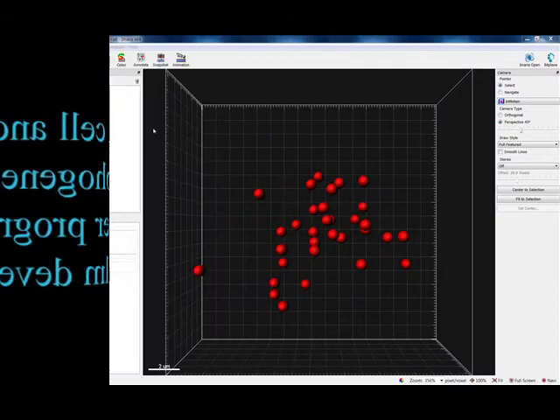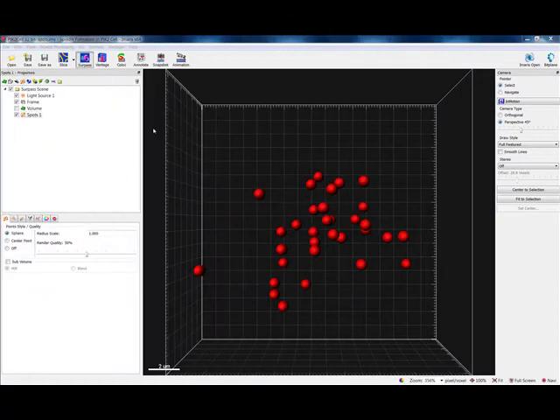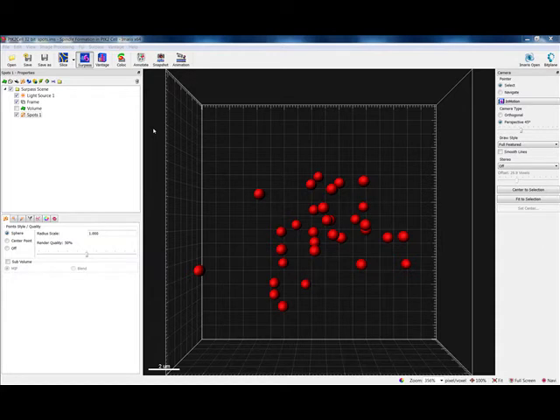We will start at the point where the Spots creation wizard has been completed and Spots objects created.